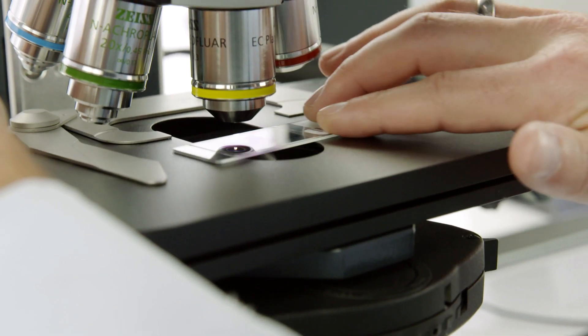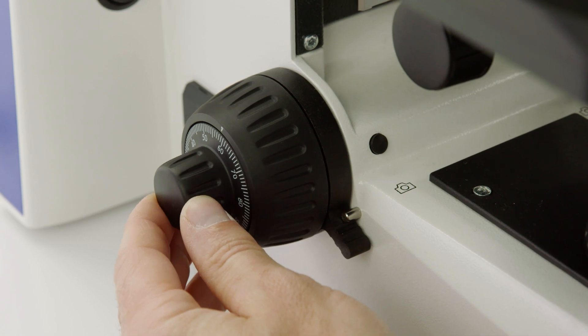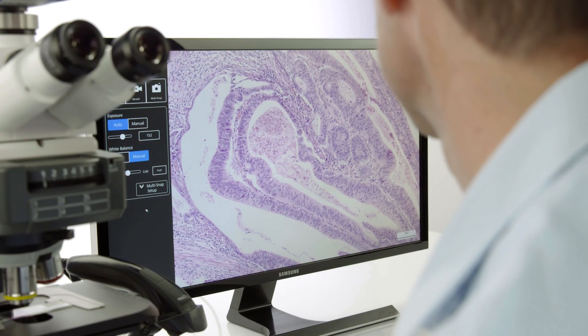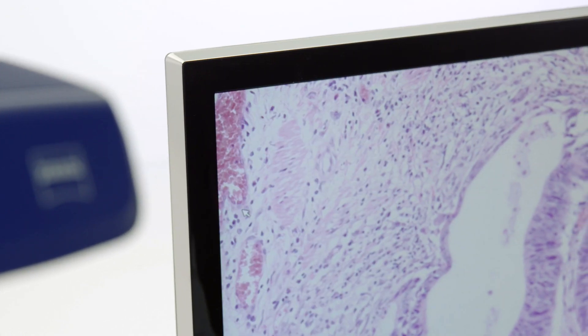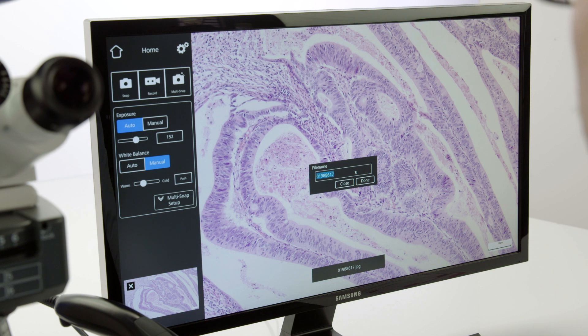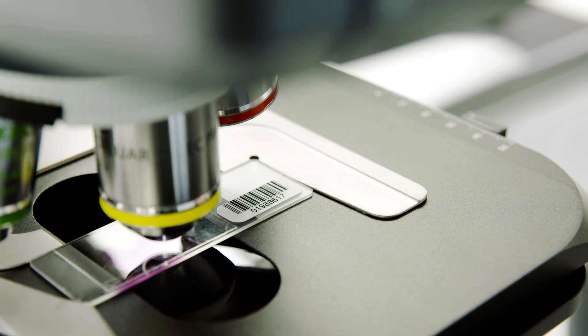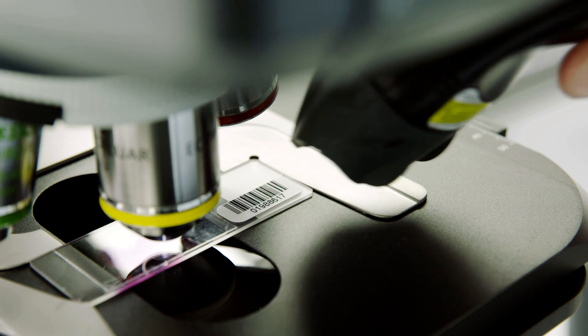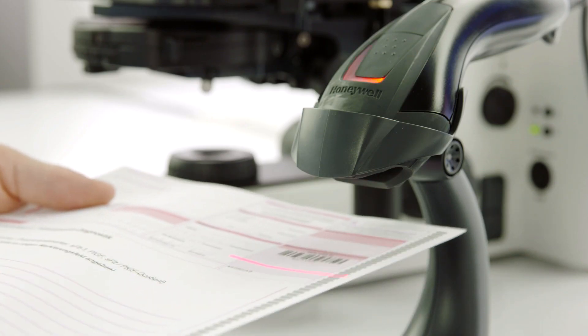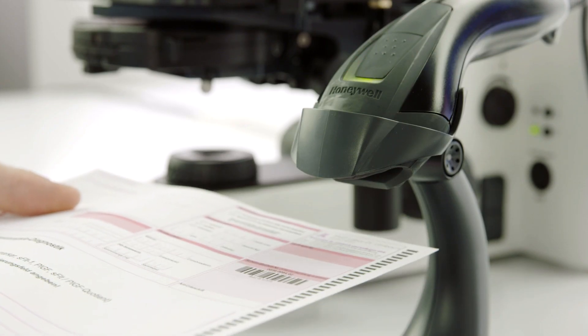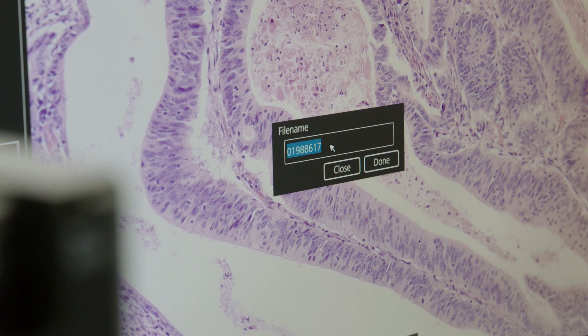Place your sample on the stage and focus. Then press Snap. The acquired image will automatically include the correct scaling information. By scanning the barcode either directly on the sample or on the patient record, you will assign that particular barcode ID to the acquired image.